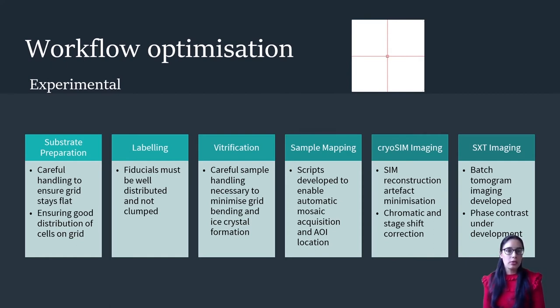optimizing the fiducial distribution to make sure that they're not clumped. We also ensure that the samples are handled carefully so the grid stays flat during imaging. We've also developed scripts to allow automatic acquisition of a mosaic image, as you can see in this video, and this can be done for both in the cryoSIM and in the X-ray microscope, so we can get a bright field image of a large area of the TEM grid.